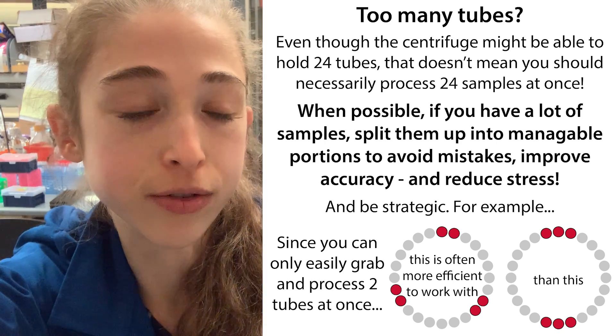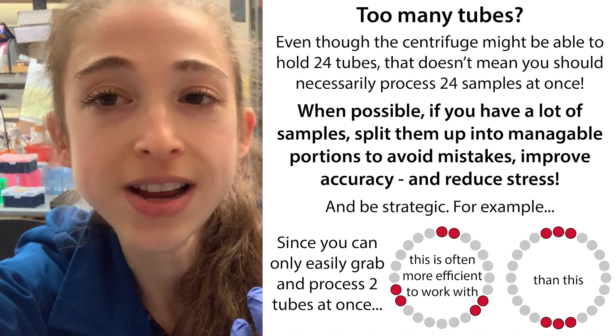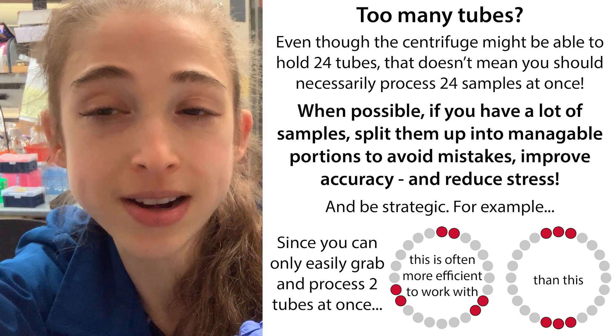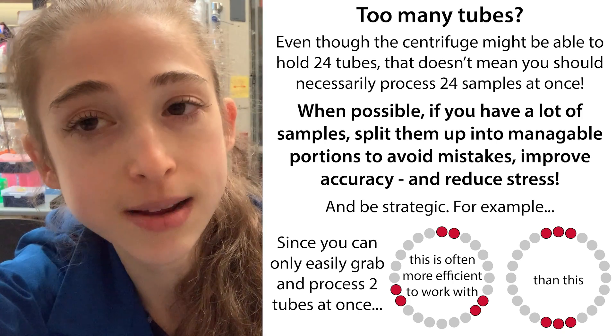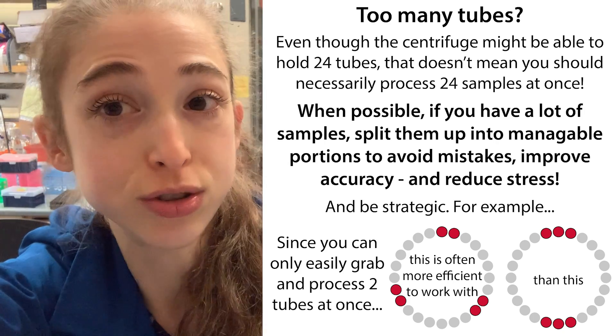You're going to have a time lag between your first sample and your last sample. If you're stopping an enzyme reaction, this could mess up your results. If it's something where there's a pellet that you're trying to isolate, it could re-suspend by the time you get to that last tube. So bottom line is it can be better to split things up.